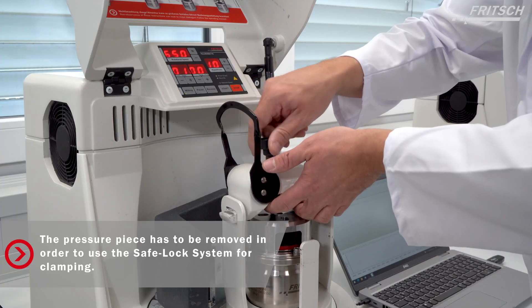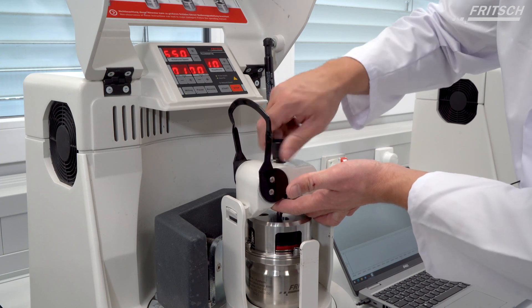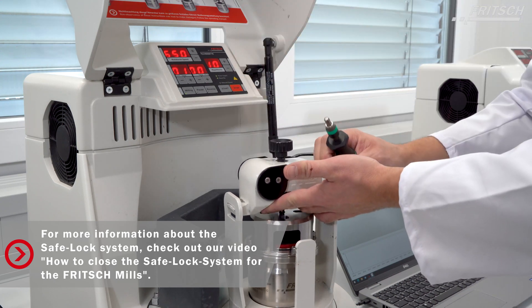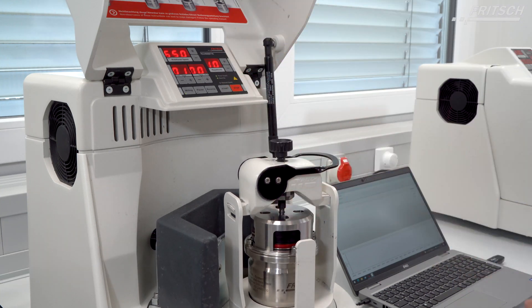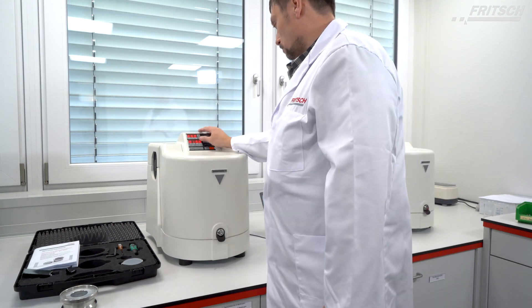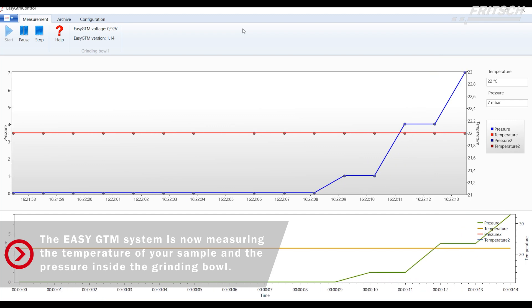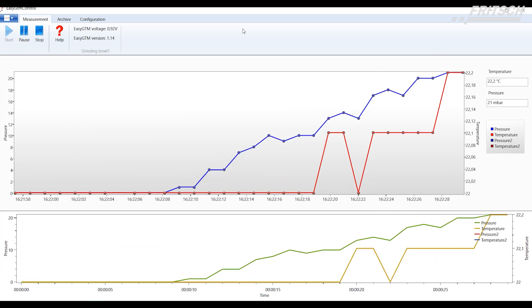Now let's proceed with the final assembly steps, rotating and securing the components into position.